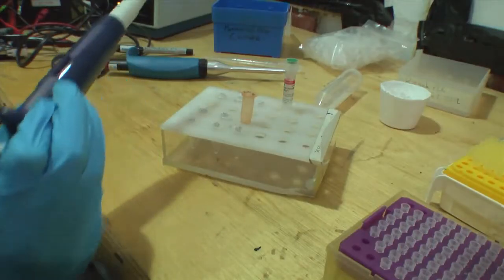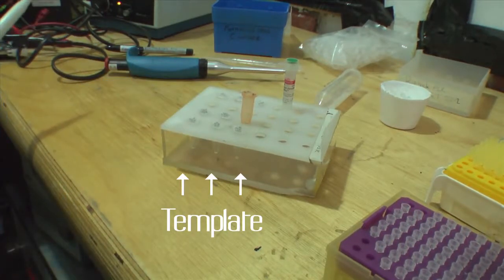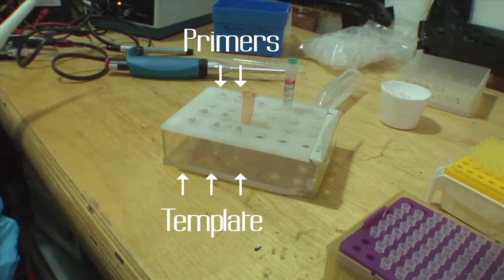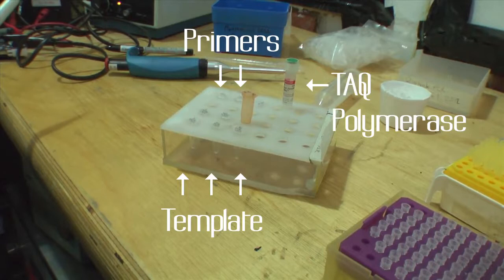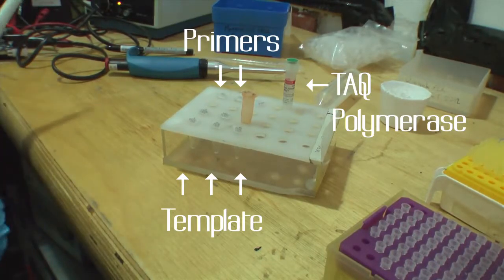PCR has certain ingredients. You've got the template, which is the DNA we've got dissolved. Then you've got primers, which isolate each end of the DNA sequence you want to get. You've got Taq polymerase, which actually amplifies the bit you want so we get lots of it, and then there's just water for dilution.